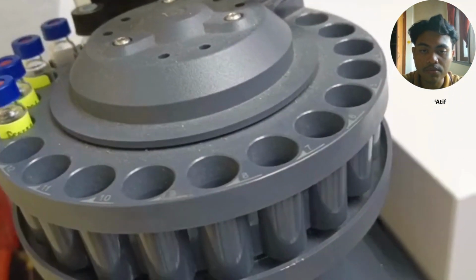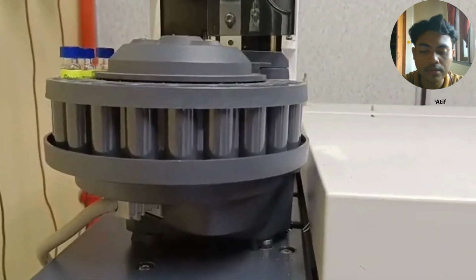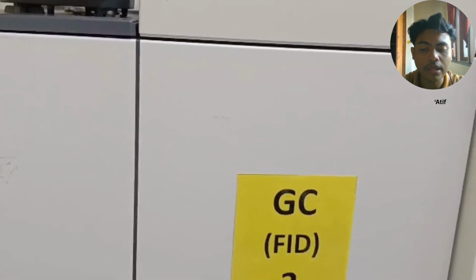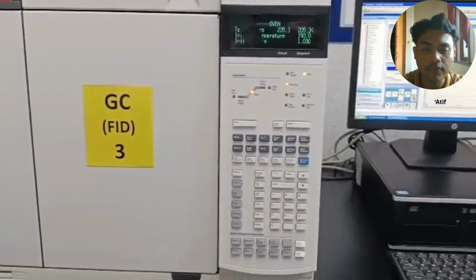What you're seeing here is the vial tray. This typically holds a number of vials that can be processed one by one according to a sequence we set in the software. And the reddish-orange circle in the center of the blue cap is the septum, a rubbery material that a needle can pierce to suck out the liquid and then self-seal once the needle is removed to prevent evaporation.